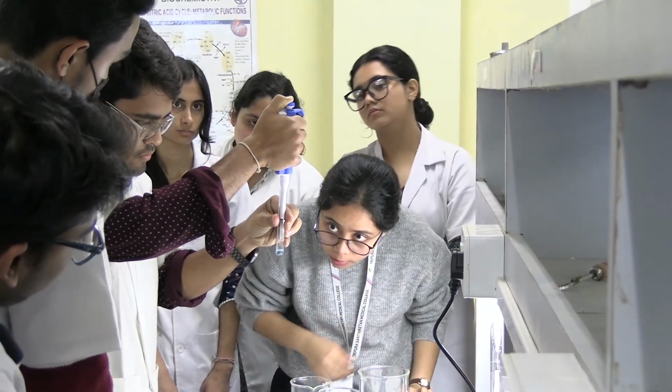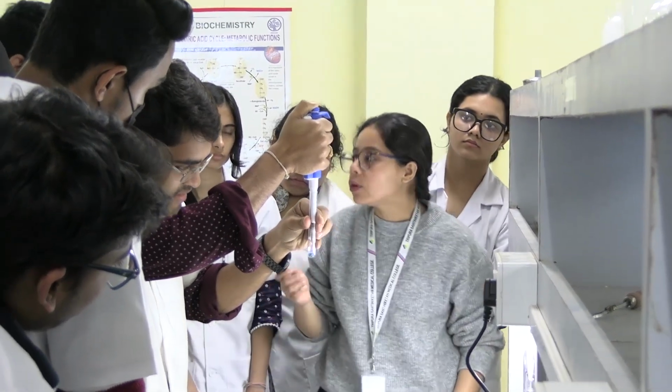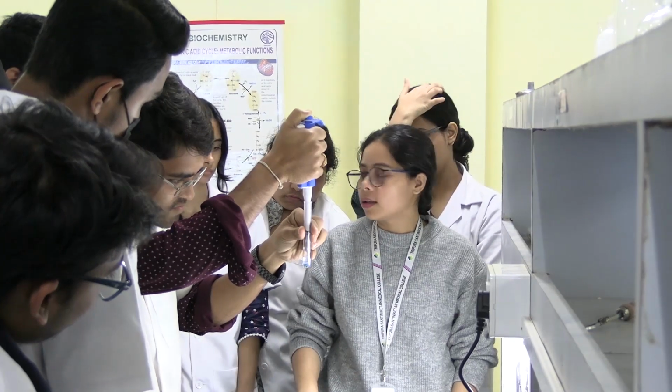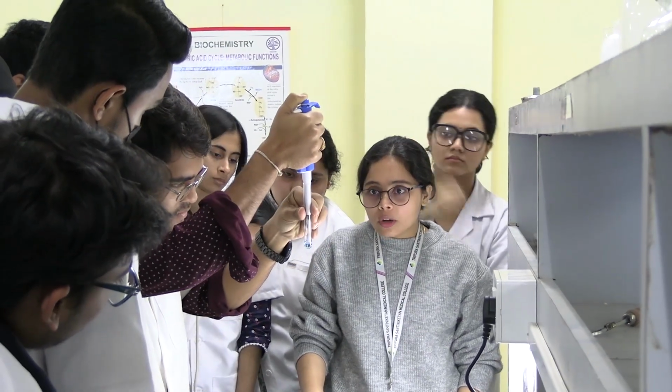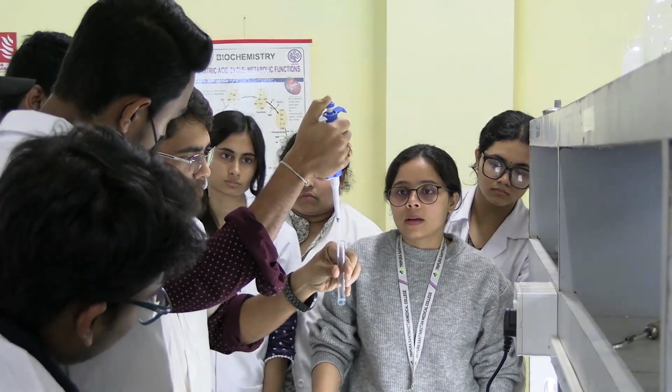Put it. Discard it hard. It will not come because it is made of egg yolk. That's why it's a little thick. It's made of not egg yolk actually, egg white. The white portion, egg white. Okay.